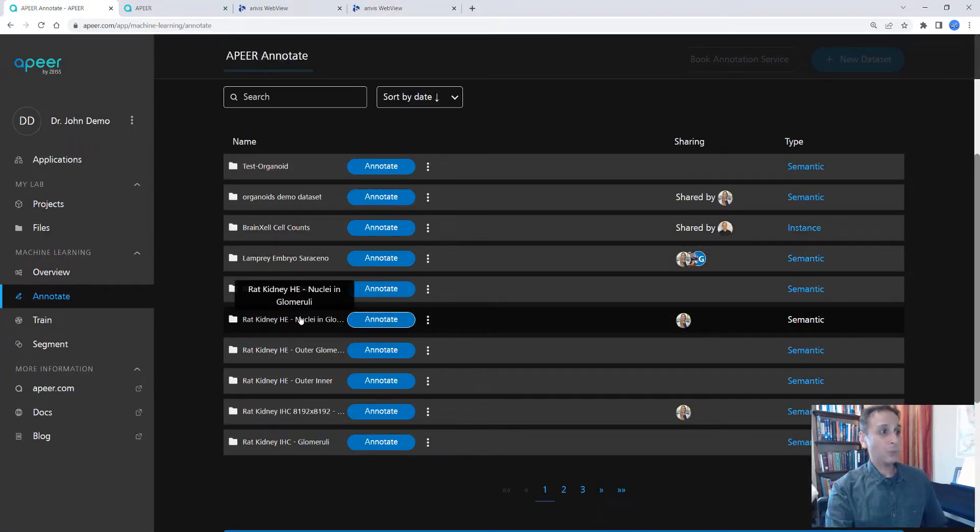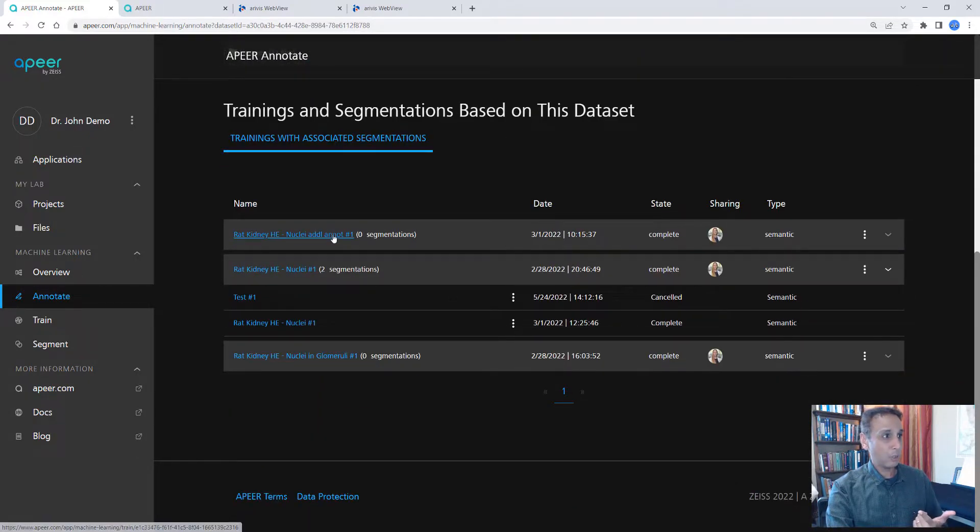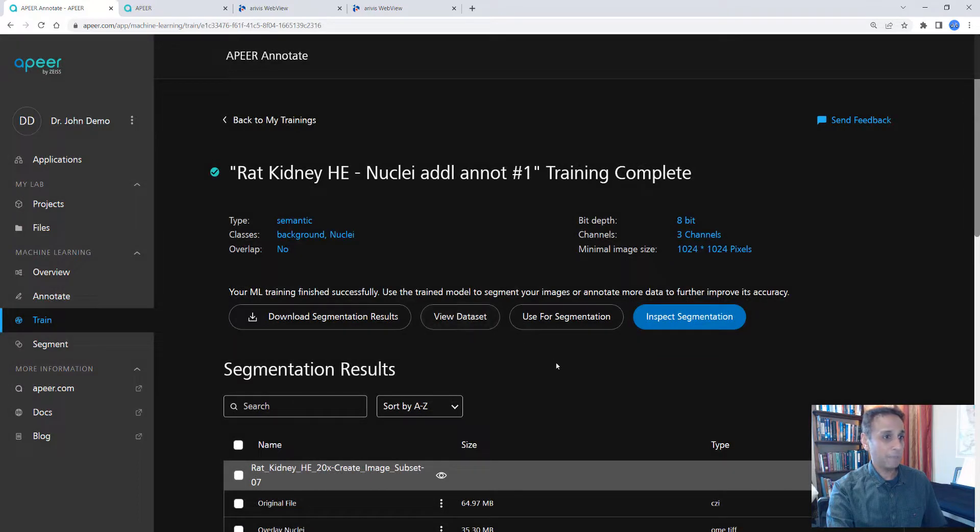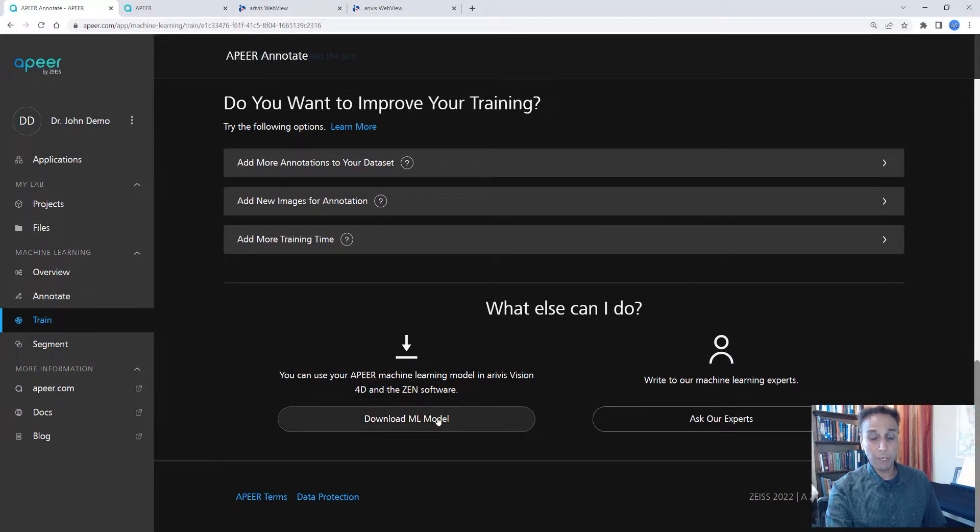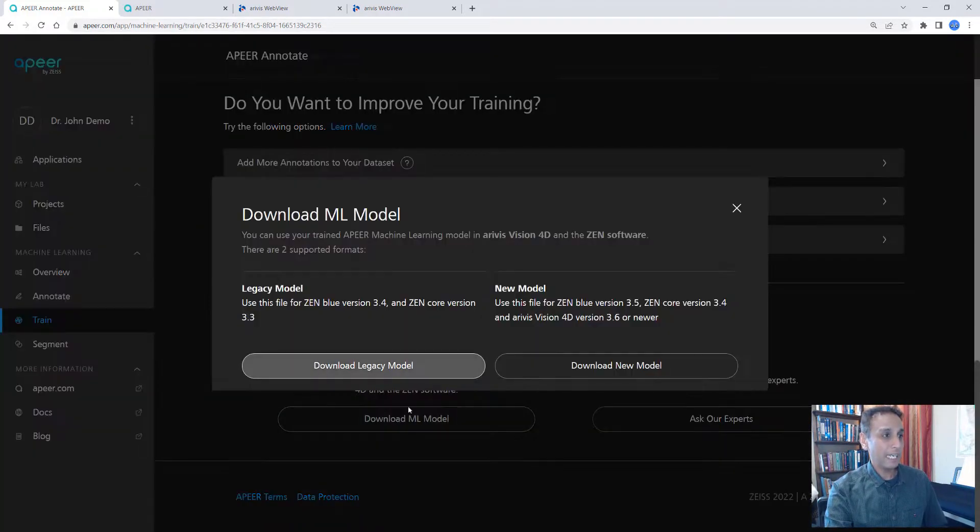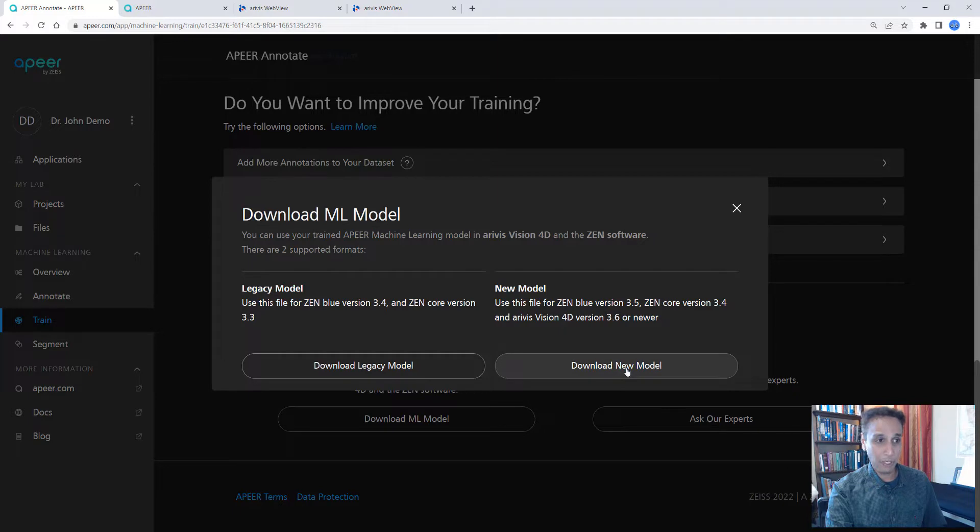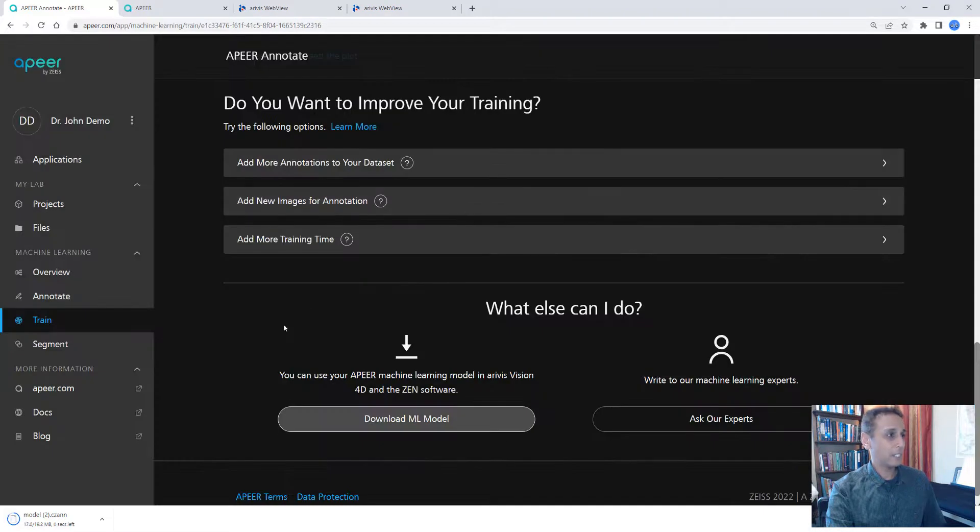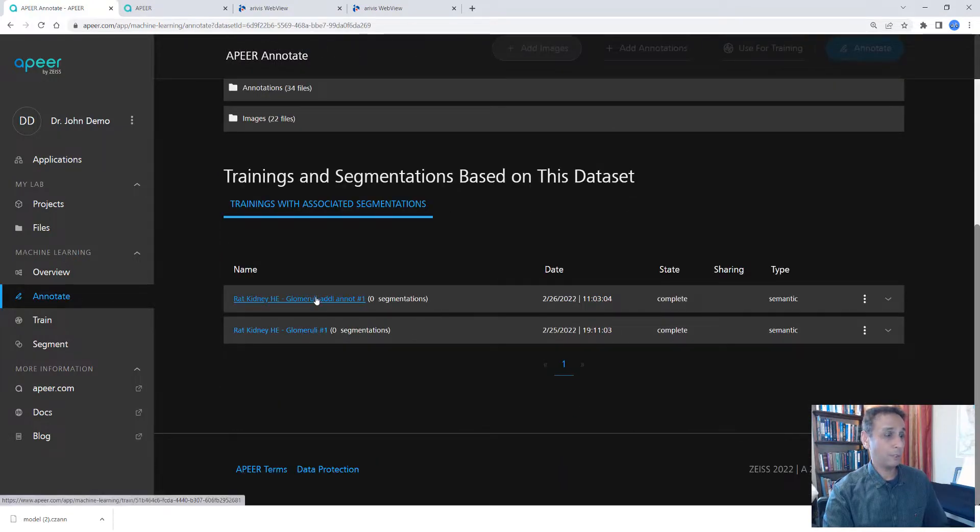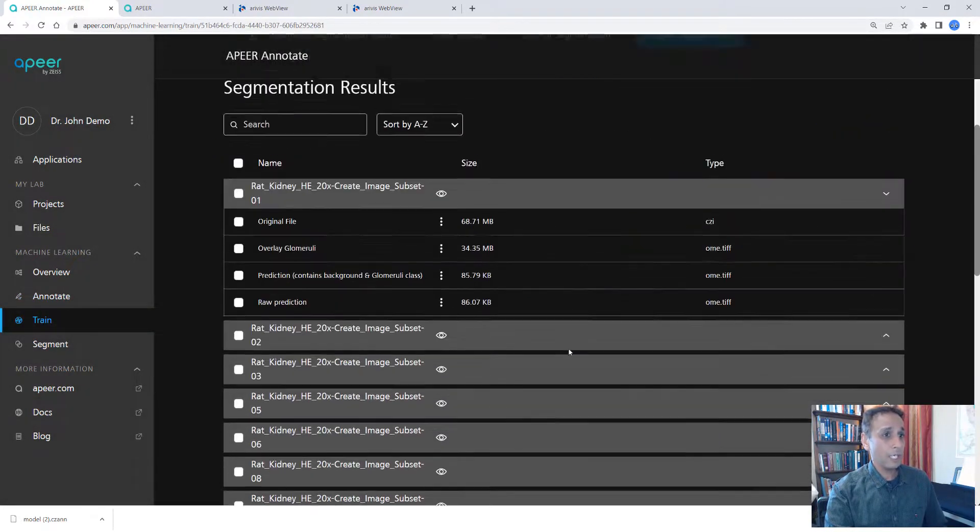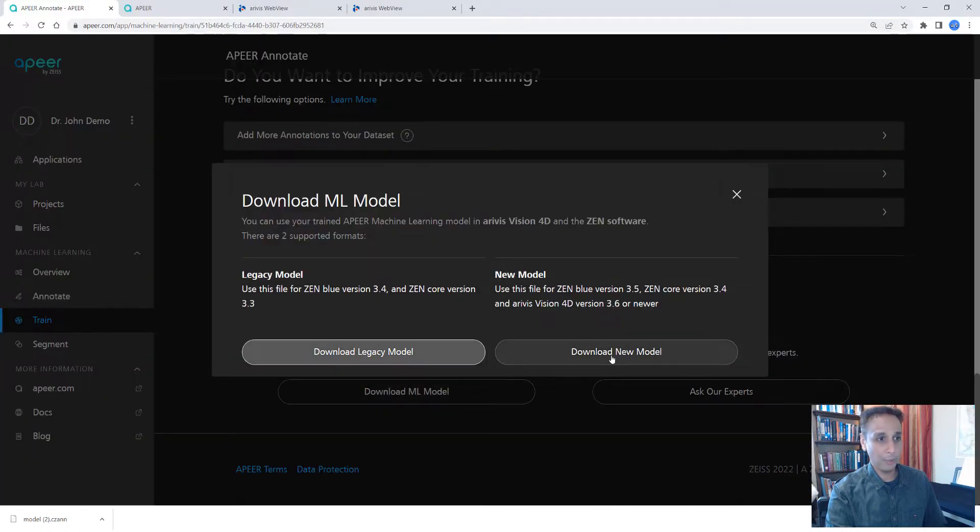Okay, so now we have these two trained models, deep learning models, one for glomeruli, one for nuclei. So let me scroll down and figure out where my trained trainings are so I can go all the way down and download the models for local use. So I'm going to click on download ML model. You can download the legacy model if you're working on Zen 3.4 or earlier, like 3.3. And if you have Zen 3.5 or later, then you can download the new model. So let's download the new model since I have Zen 3.5. And while it's doing that, we can go back to our train and download the glomeruli model.